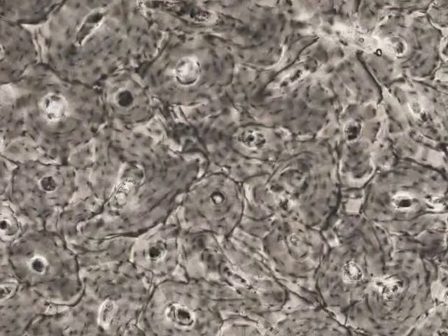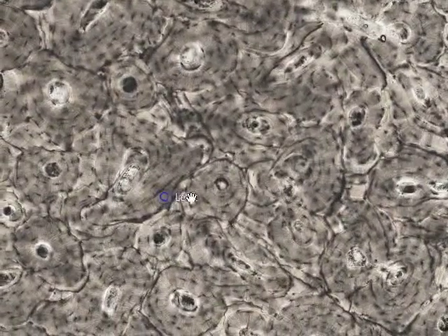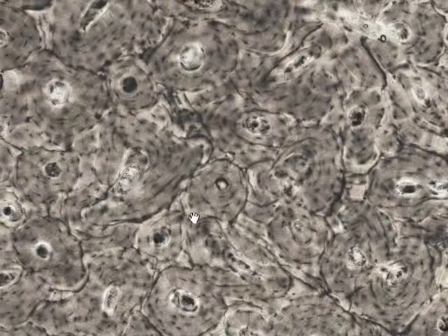If we increase in magnification again, and if we concentrate really on just looking at here is one osteon here, here's another osteon here. The center part of the osteon is the Haversian canal, and the fact you can see some dark material in it is indicative of where the blood vessels and nerves and so on, and the endosteum that would have lined that Haversian canal would be found.